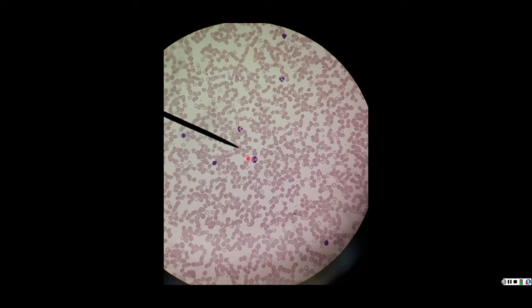We see these other things that have the purple blobs in them, and those are our white blood cells, or our leukocytes. Now, white blood cells, leukocytes, leuko means white, and again, cyte means cell. These are primarily responsible for our defenses, our immune response. And we're going to spend a whole chapter looking at the different types of immune responses that we have, and they will refer back to a lot of these white blood cells, or leukocytes, that we're learning in this chapter.